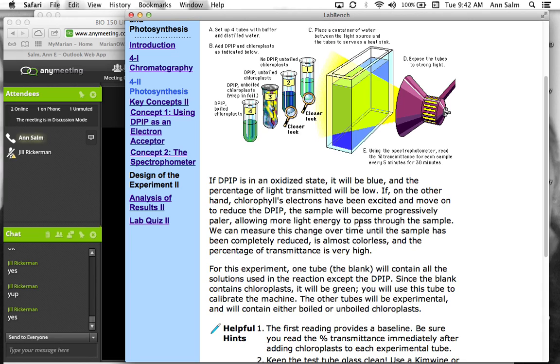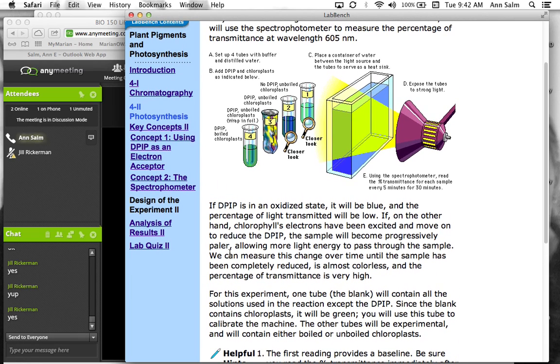So this is how the experiment is set up. Are there any questions about that, Jill?